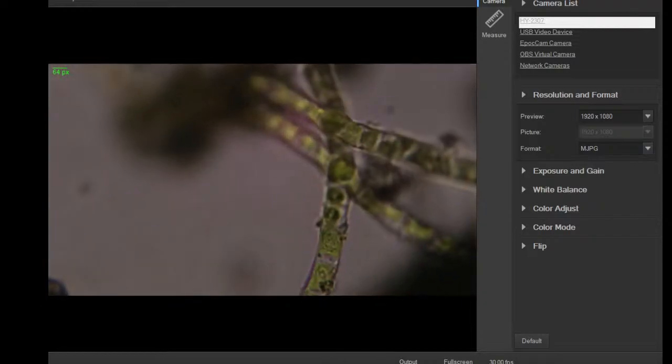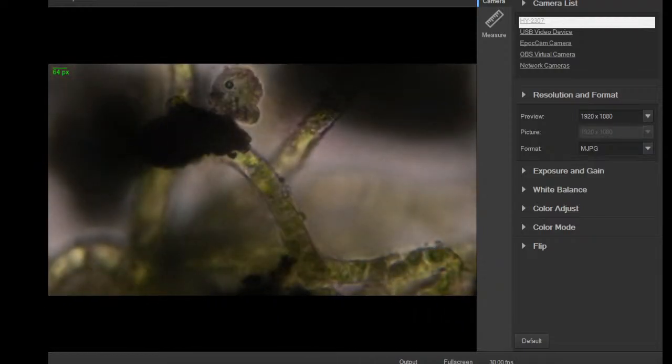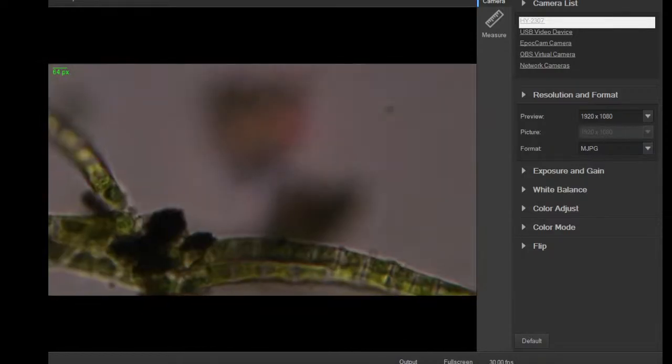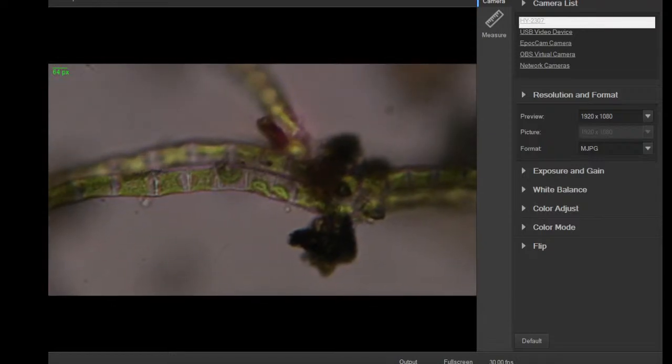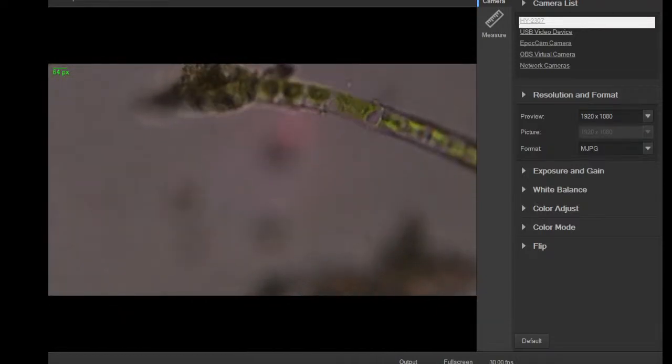Yeah, osmosis is useful for life, but it's also a killer, which is why they have to use essentially a type of active transport using the contractile vacuole to osmoregulate the cell, keep the pressure. And you'll see them go from being somewhat normal, flexible, gelatinous guys to getting kind of turgid and a little more spherical, and pretty soon pop.